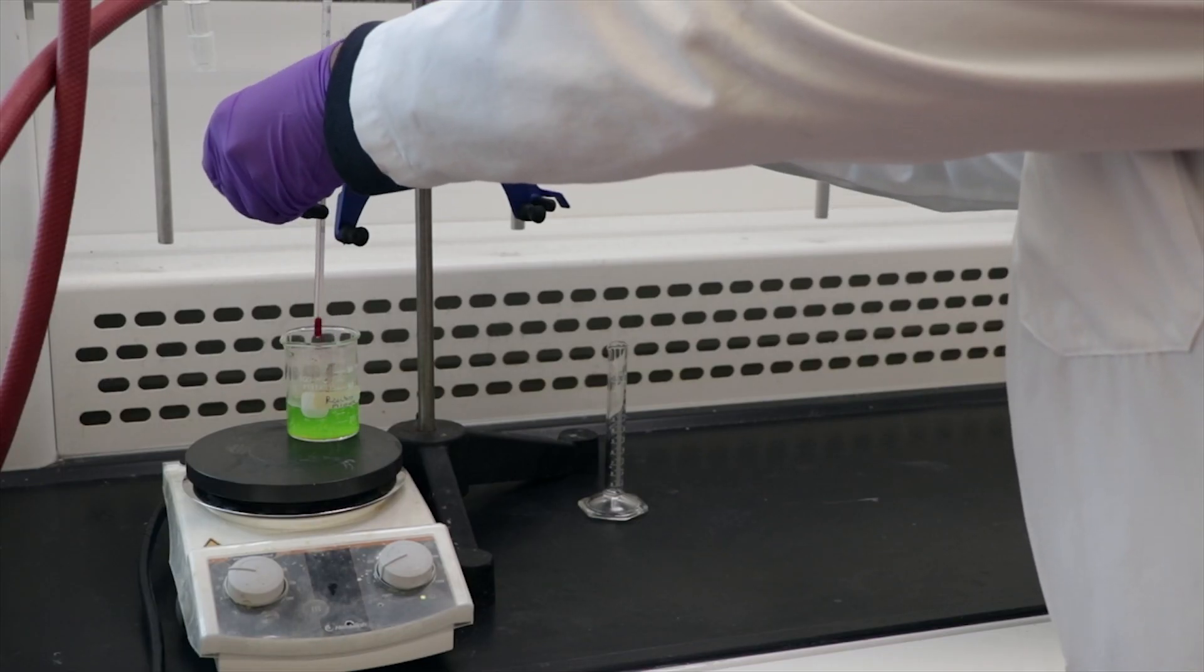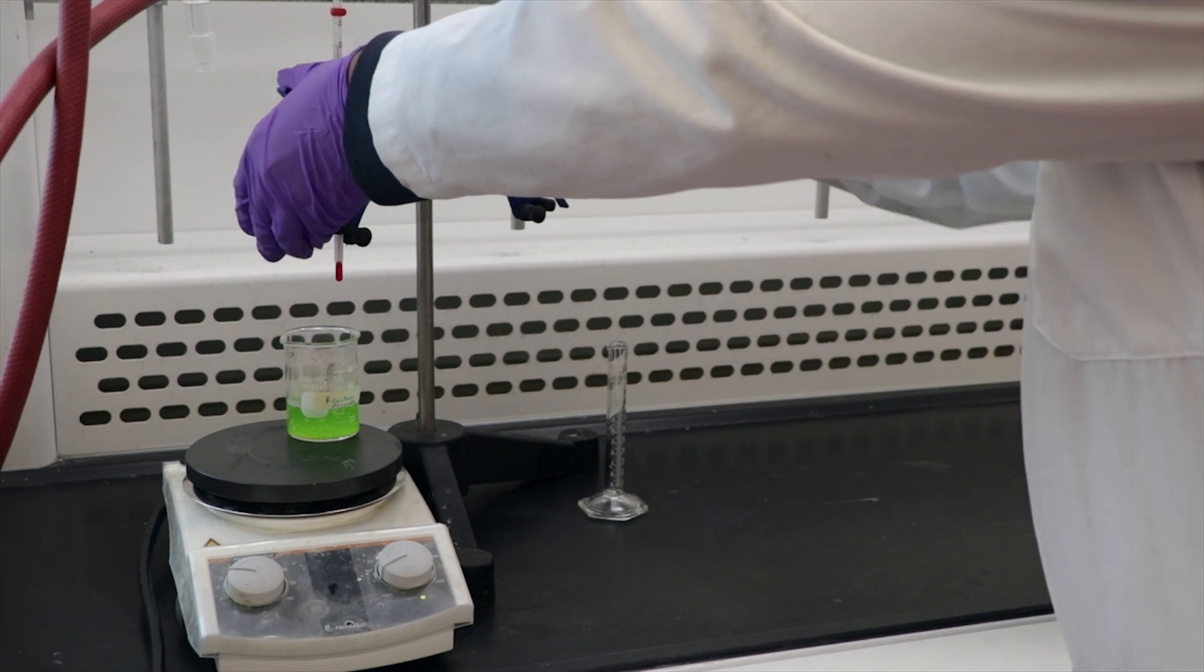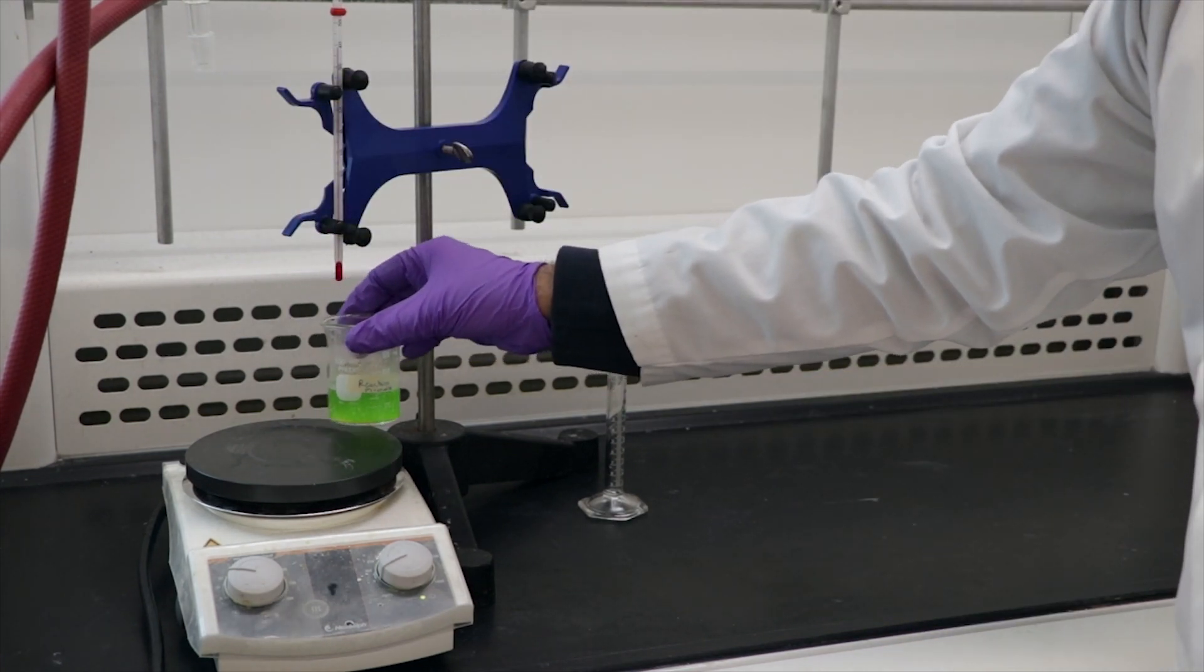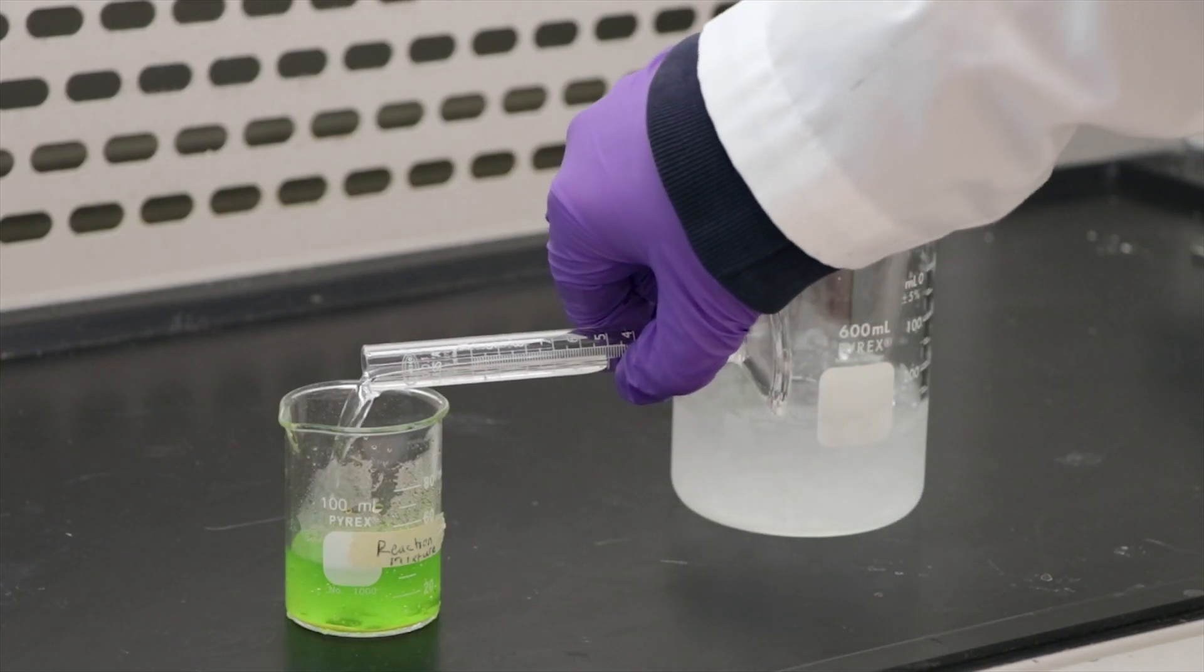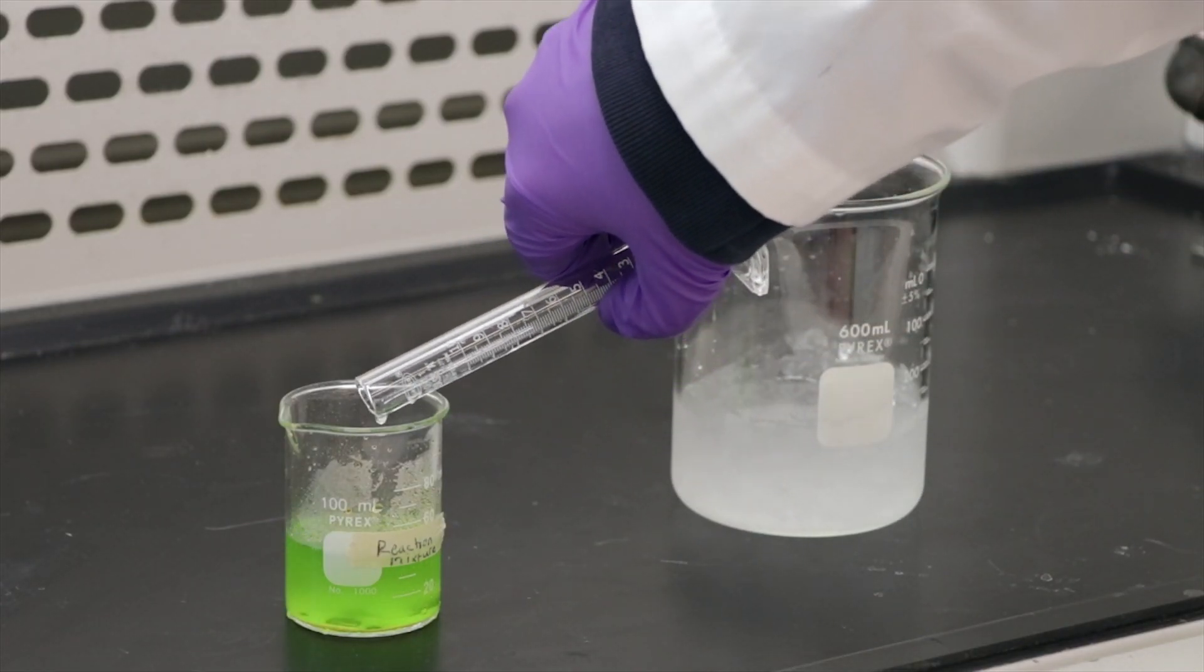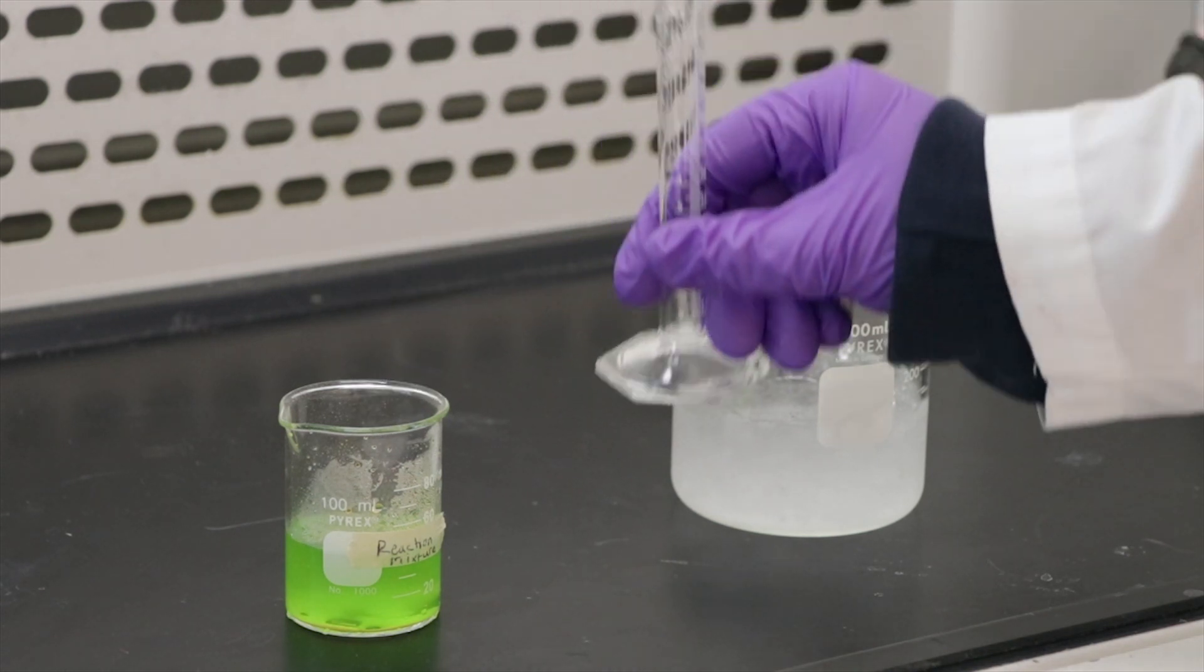Now we are going to crystallize the product. Take the solution off the hot plate and let it cool down to room temperature. Once cooled, add 10 ml of ethanol and place the solution in an ice bath to crystallize your product.